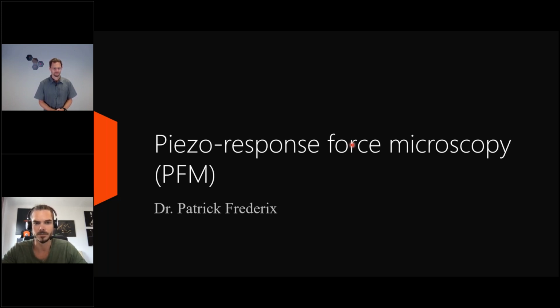And today we will focus on a topic we actually received many requests to hold a webinar about over the past half year since we've been asking for topics. And Dr. Patrick Frederix will show us the ins and outs of Piezo Force Microscopy today, explaining the physics behind the mode, how to perform it on a Nanosurf instrument, and also some application examples, of course.